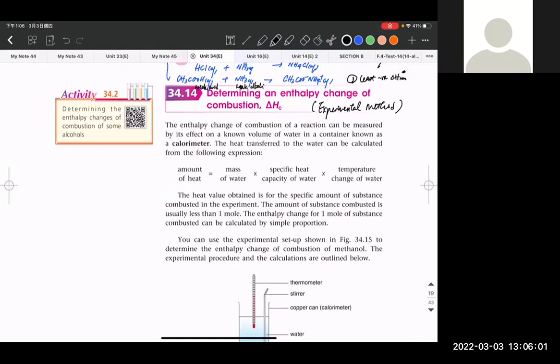Now, take a look at that. First of all, I will show you the lab video shortly. What you read, I would like to ask you about the three items. First of all, your science principle. What is the underlying principle? Second, what is the mathematical treatment of the data? Once I've collected the data, how will we tackle it and arrive at the answer? And 3, any errors of the experiment.